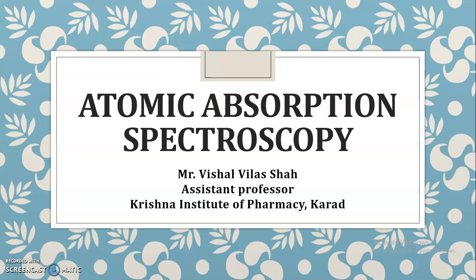A new session of Instrumental Methods of Analysis, Atomic Absorption Spectroscopy. In the previous video, we finished with flame photometry, which is also known as atomic emission spectroscopy. Here we are going to start with atomic absorption spectroscopy, which is different from, or exactly you can say it's the reverse of, flame emission spectroscopy.